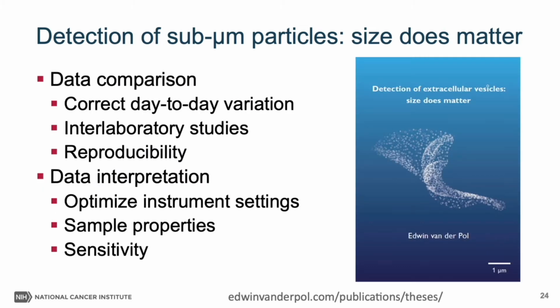Thus, size does matter for the detection of submicrometer particles to enable data comparison and data interpretation. Regarding data comparison, I don't only think about comparing data to other labs, but also to correct for day-to-day variation and to allow other labs to reproduce your data.